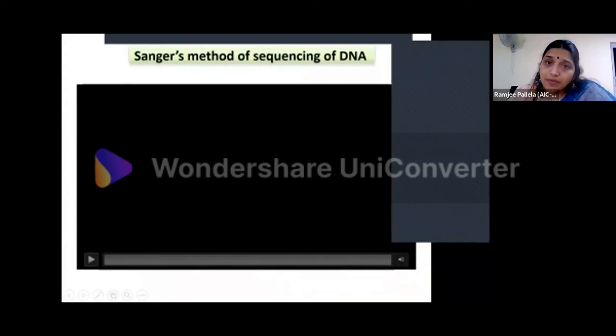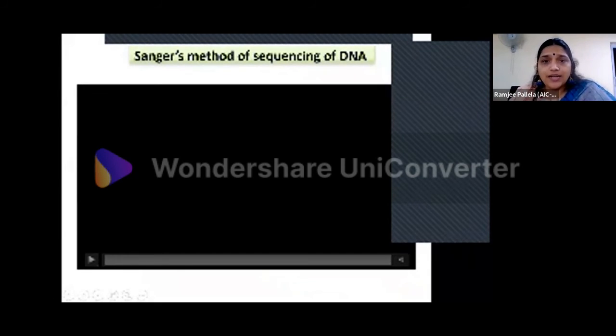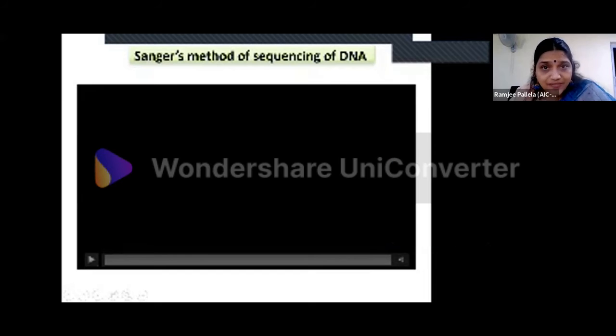Now, there are many methods of DNA sequencing, but the most commonly used is Sanger's method of DNA sequencing. Now, let us see what this method is all about. I'm again using the audio of this particular video because it is very self-explanatory, and I'm sure you will understand better in this. If you have any queries, you can ask me later.